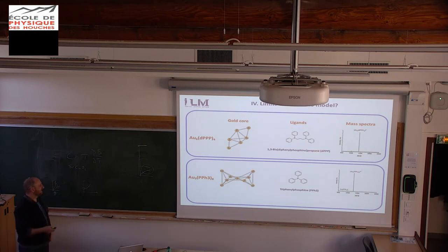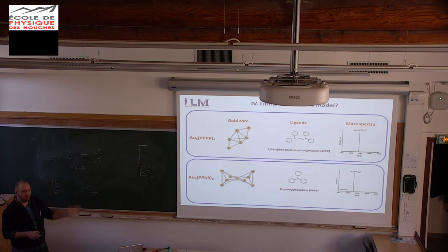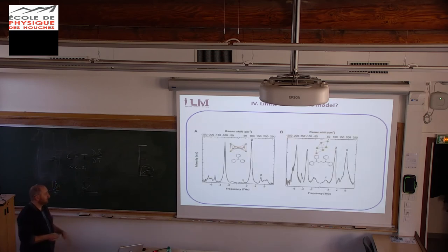It's something a bit strange, there are ligands. But the good point is that the chemists do that with really high purity. So that means, as this mass spectra shows, that we have only one type of aggregate in the powder we are studying. So this is fine for Raman, and this is the spectra you obtained.